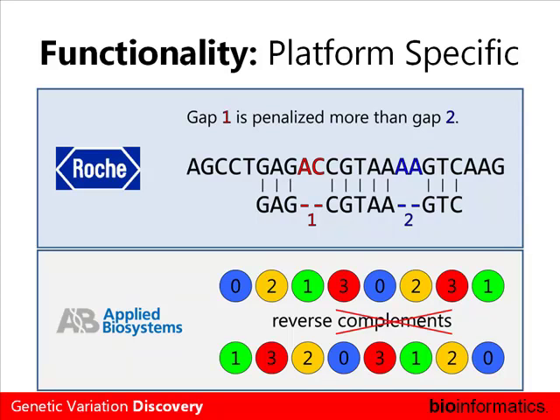How do I decide what size of k-mer you use? Okay, so in our lab, we've just standardized on using a k-mer size of 15. That's what we use for most things. Most of our work is on mammalian-sized genomes, and so 15 is basically a compromise, improving the speed there. When it comes to bacterial or yeast-sized genomes, then we'll probably go down to like 9. It's really a sensitivity versus performance type exercise.